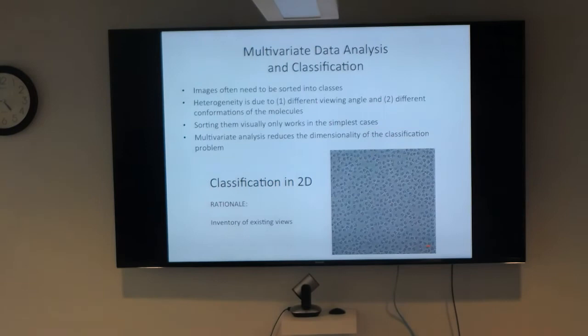All right, so I already know that I'm running out of time. So I just wanted to tell you about multivariate data analysis, classification.